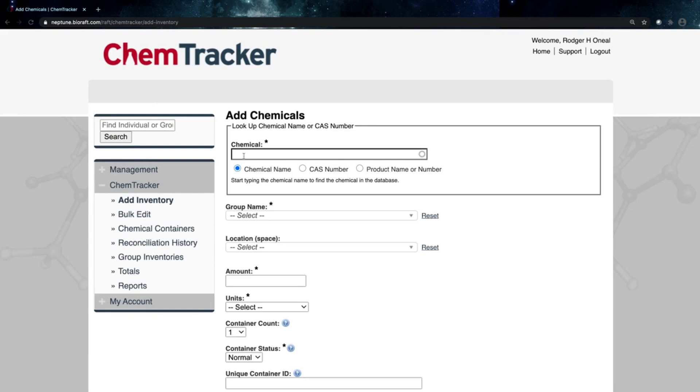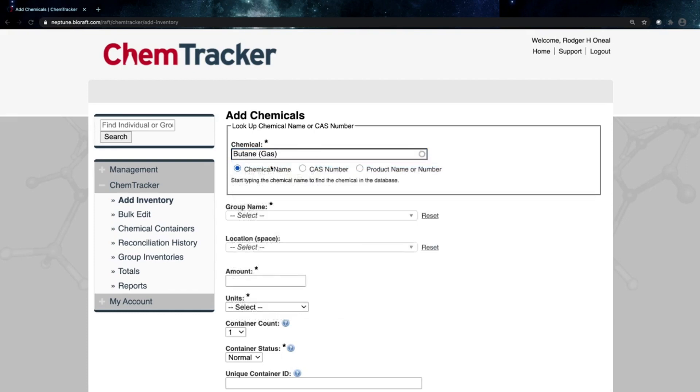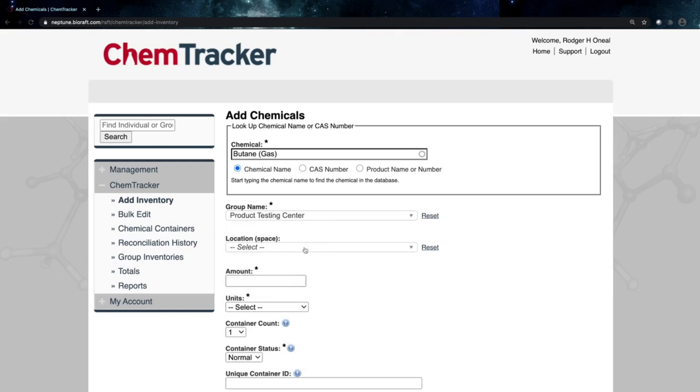Now first, let's find that chemical we're going to enter. Again, we're going to be entering butane today. So we're going to go ahead and find butane in the ChemTracker chemical database. We'll go ahead and select that here. I'll then select the name of the group that's going to own this container. So it may be our product testing center.